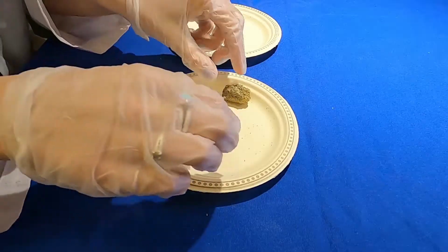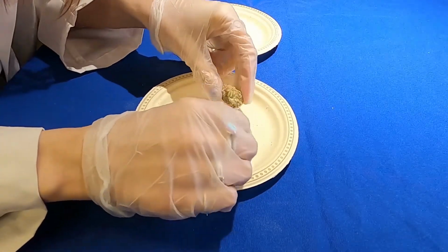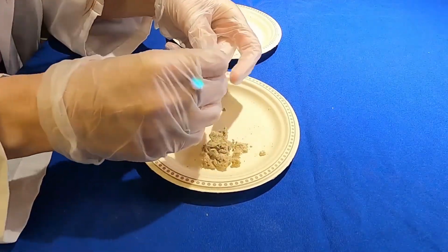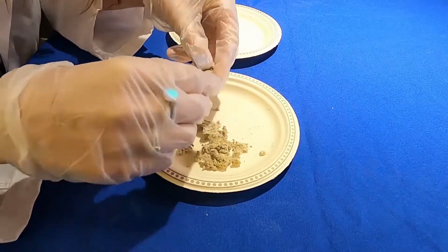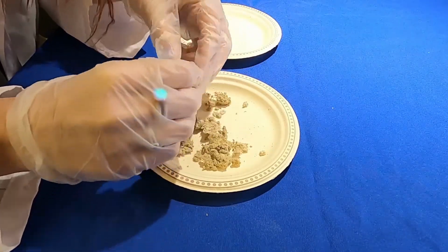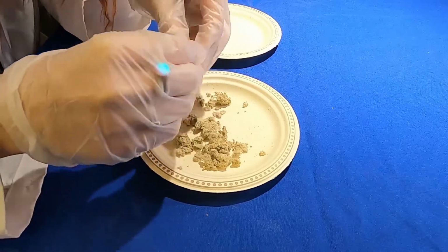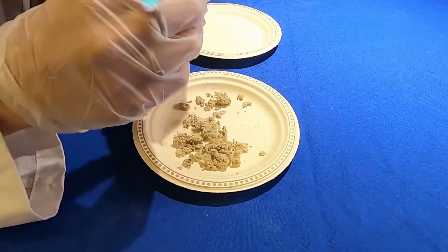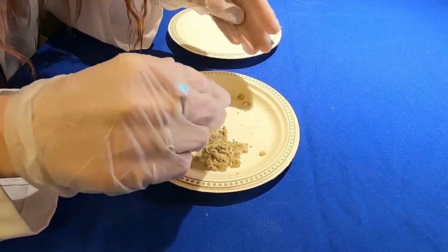There isn't really a specific way to do this, but I like to just dive right in by pulling the pellet apart and displaying all the materials on the other plate. So as we're pulling it apart in here, you'll notice that it's coming apart pretty easily. That's because this pellet specifically is just pretty old. And when they are older, they're going to be a lot easier to pull apart versus some that are fresh.